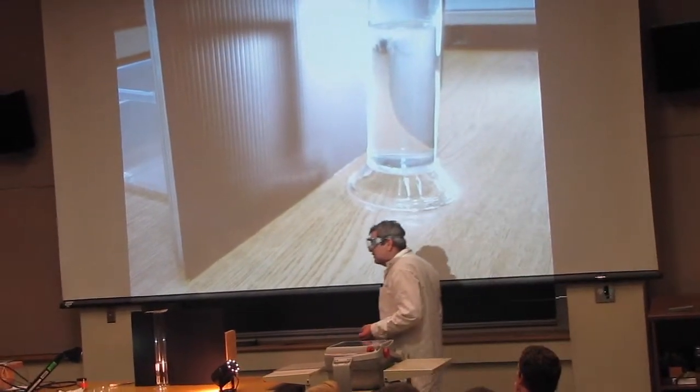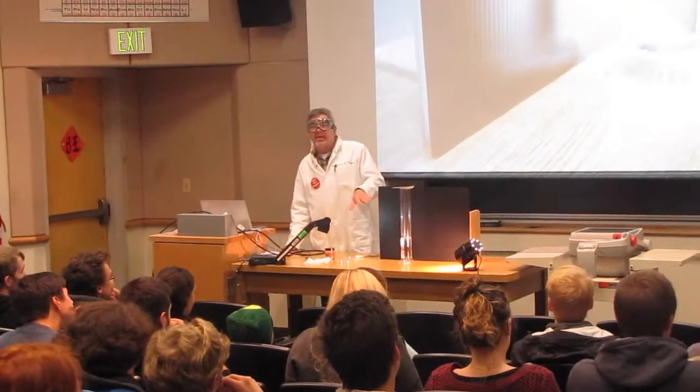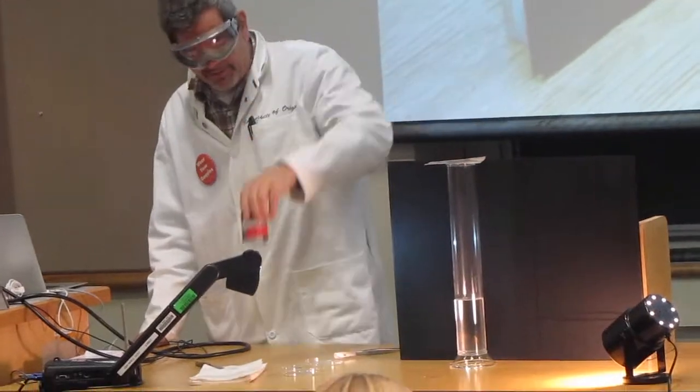Okay, good. So it reacts with water that way. What's the gas? You also notice another physical property. What about its density? About its density relative to mineral oil? Less than. It's floating.